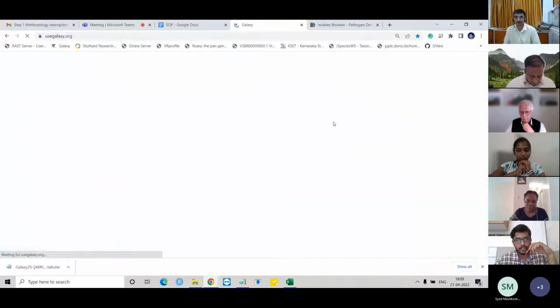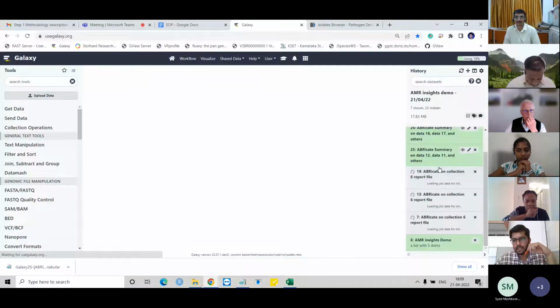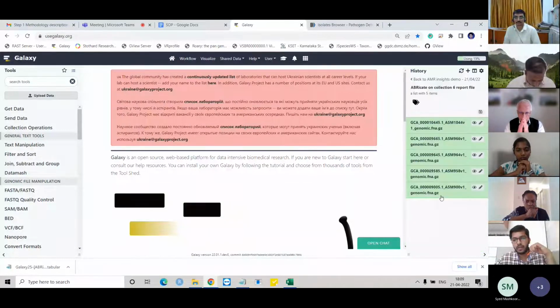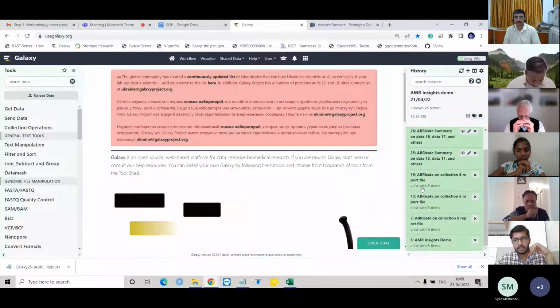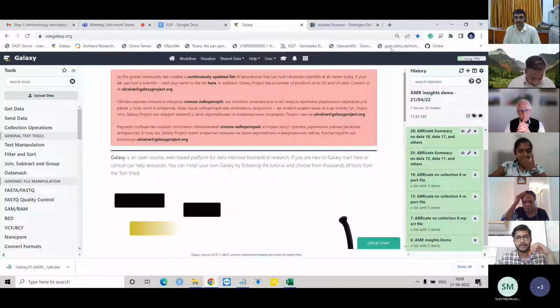Thank you. One point I want to make here is that when you have run here, the number has started from 5, I mean 6, and then it went to 7, then directly 13, because when you click on this, these numbers are counted. So you may not get continuous numbers when you're handling large data set collections. So it is better to write down the numbers, because they are not in continuous order. They will go from 13 directly to 19, then again 25. In between, the numbers are the data numbers that will be given to the individual data files. Okay, got it.